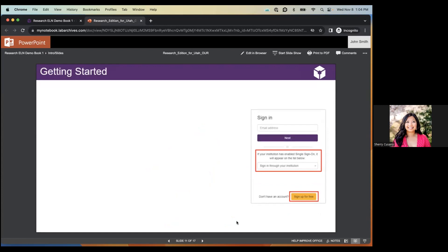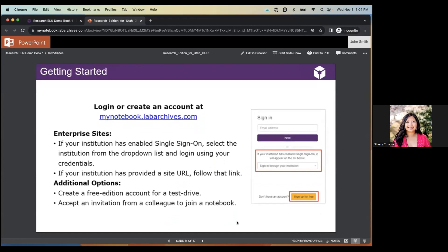To get started, you'll need to create an account at mynotebook.labarchives.com. Utah has single sign-on for Lab Archives, so instead of typing your email address, you'll click the 'Sign in through your institution' dropdown, find the University of Utah, and it'll take you to the Utah page where you can enter your Utah credentials to create your account or log in. No extra username or password to remember.